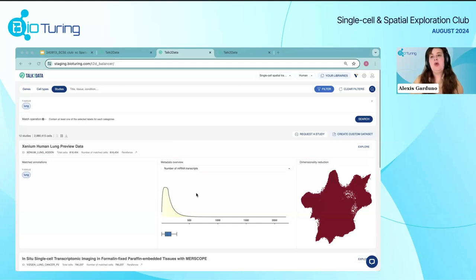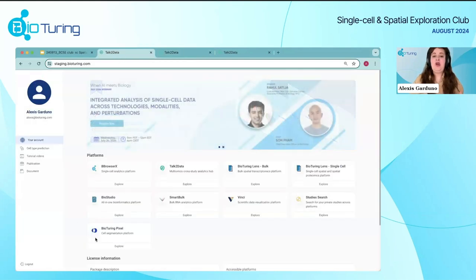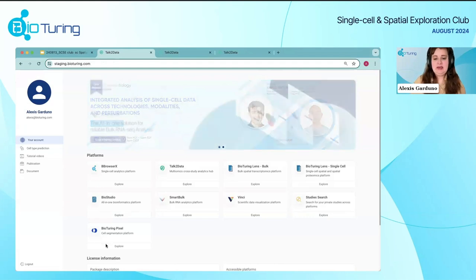Okay. So I guess in the next session, I'll give some time so that you're able to answer the survey. It's really important to us to see if it's useful for you, or if there's any case study that would be more relevant to your analysis that you would like to see, how we can use the system or different applications in the system. Please let us know, because we do have other different applications we haven't already gone through in the Exploration Club. So please give us some insights into that.